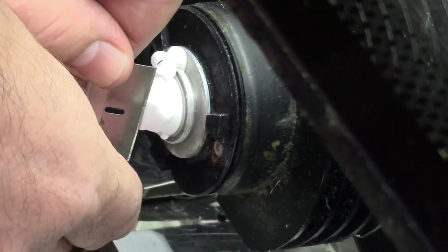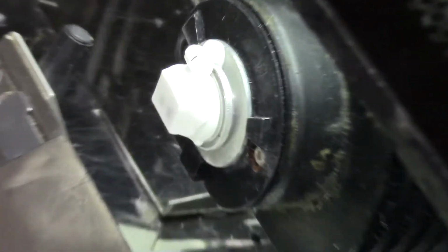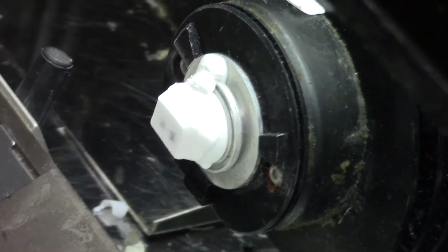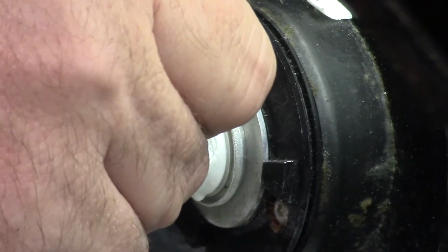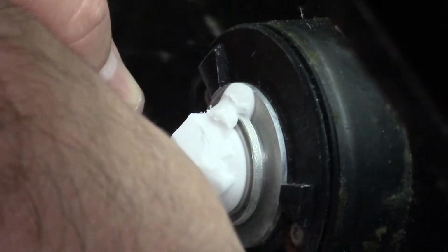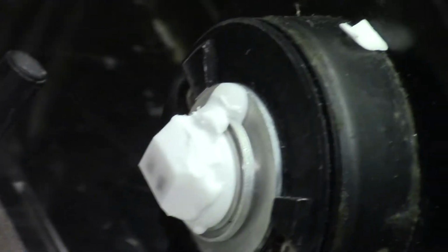There's extra OCT there. So what I want my knife to do is only give me a piece of OCT that is just barely surrounding my two pieces of limb tissue. And that will give me the right size block so I can fit multiple tissue sections, even multiple rows of tissue sections, on the slide. So now I'm cutting away from the left side, and now I'll even cut just a tiny bit from the bottom. Since I already put them towards the bottom, I'll be cutting less off of the bottom than I do off the top. Let's pause.